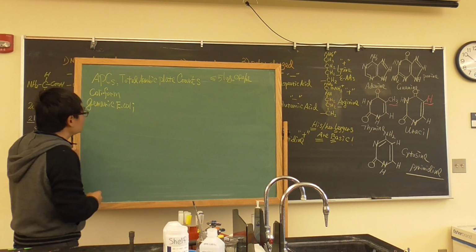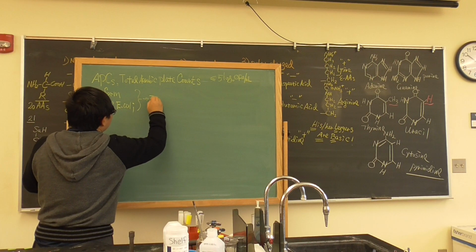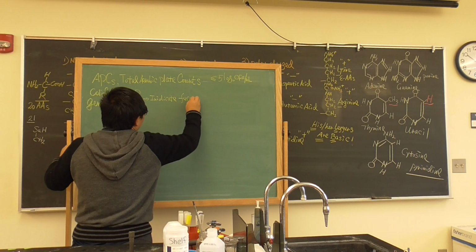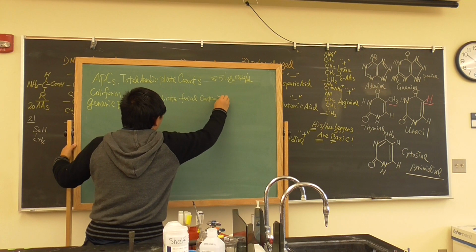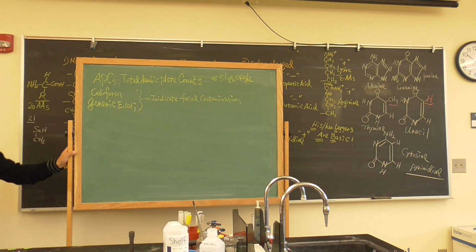Okay, what are coliform and generic E. coli for? A long time ago, people used these to indicate fecal contamination. What is fecal contamination? Said very rudely, it's human poop contaminating the food supply chain. That's not good. You certainly don't want your vegetables to have human stool samples on them.